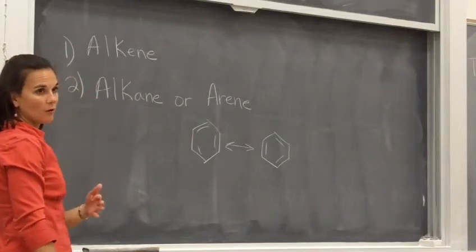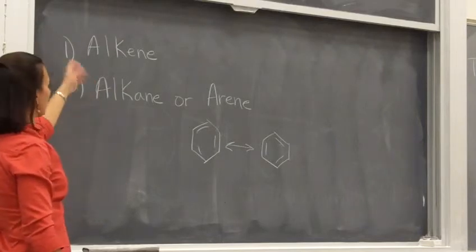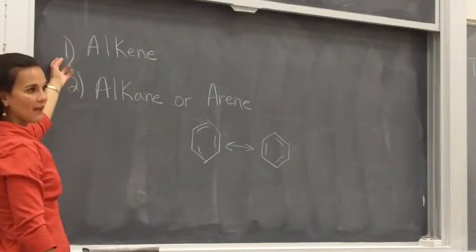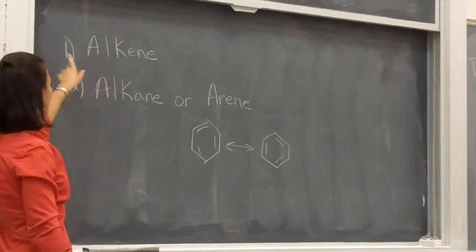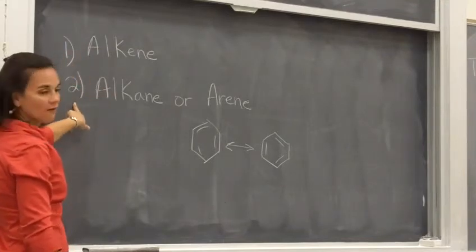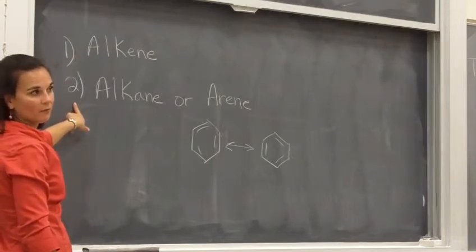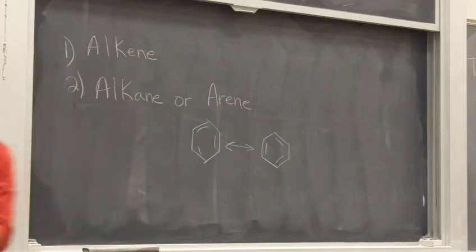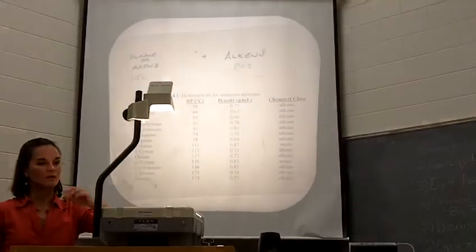One of them is lower boiling, one of them is higher boiling. It doesn't matter, the higher boiling can be the alkene, the lower boiling can be the alkene. It doesn't really matter, okay? It's just you've got one of these and one of these, and one's a higher boiling component and one's a lower boiling. Okay? And so if you look in your lab manual, you've got the possibilities of your unknowns.